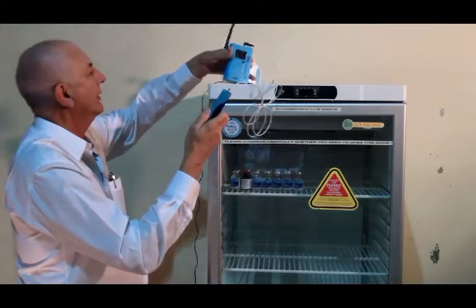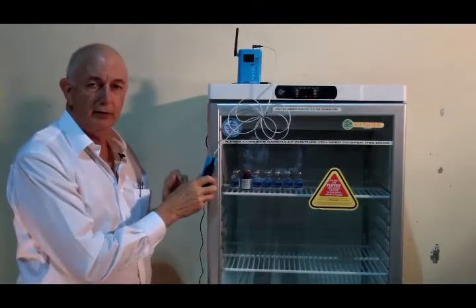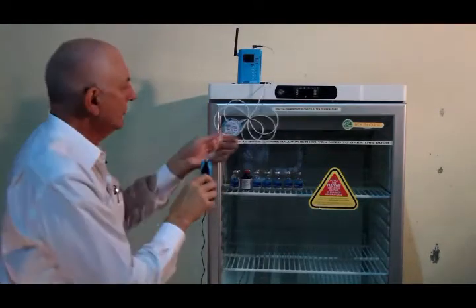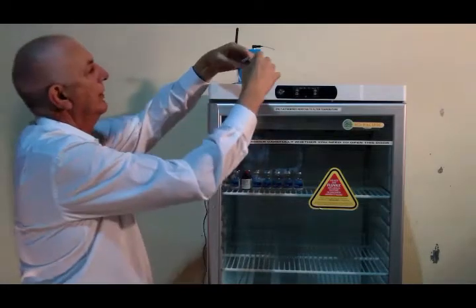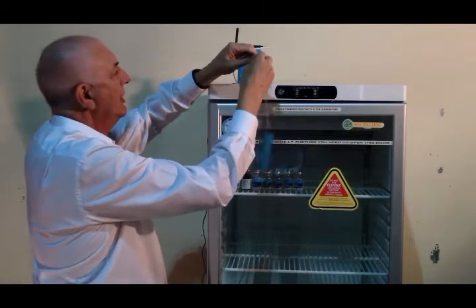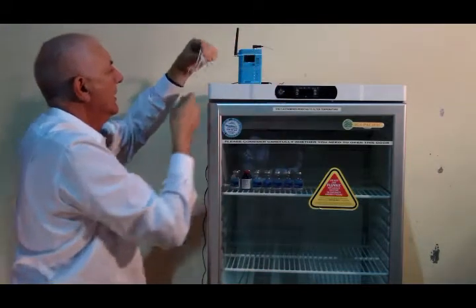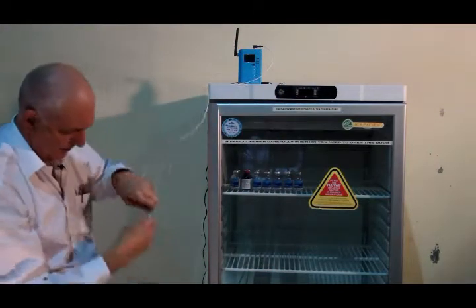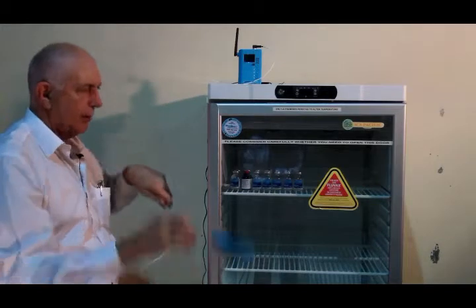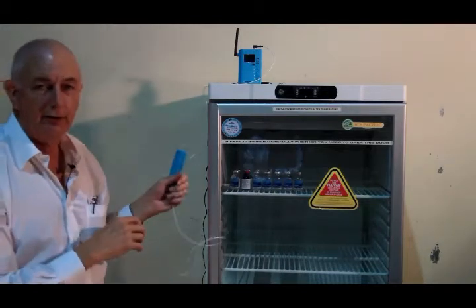We'll put that unit on top of the fridge in a convenient location. The probe sensor has a twist tie, so we remove the twist tie and that frees up the probe. The probe now needs to be put into the vaccine fridge.